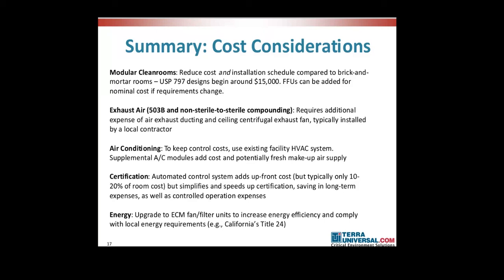An advantage of those systems also is that we can log those data so that you have a traceable storage history of room performance over the course of your certification period, 24/7.